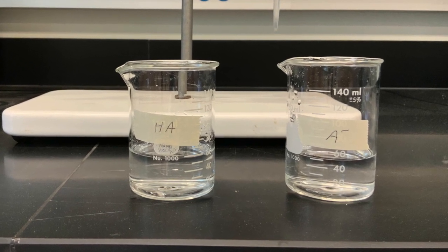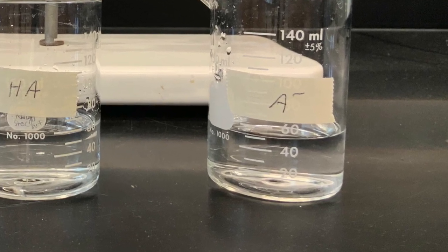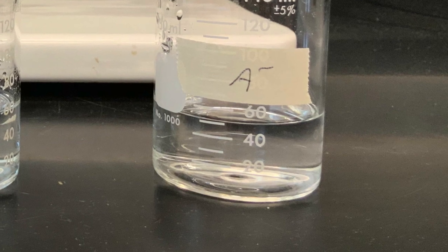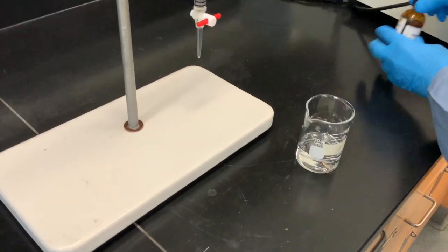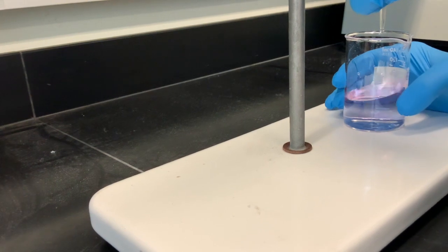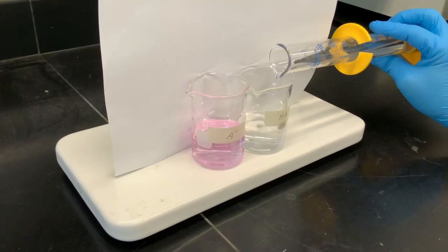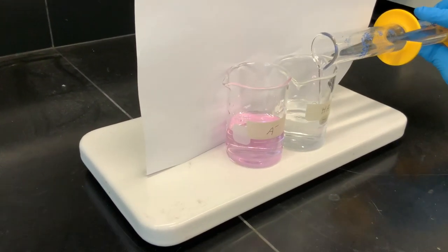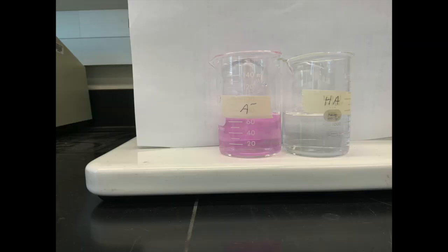The acid in the beaker labeled A- will be converted to its conjugate base by titration with 0.1 molar sodium hydroxide. To start the titration, we added 3 drops of the phenolphthalein indicator. We then titrate the acid with NaOH until we reach the equivalence point as shown by the light pink color of the solution. We then add water to the original beaker, labeled HA, to the same volume as the beaker containing the pink A- solution. As you can see, both beakers contain solutions to the same volume.